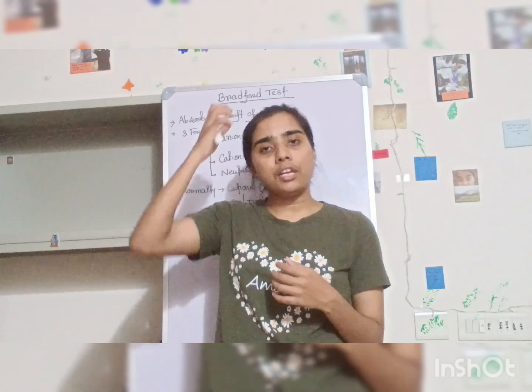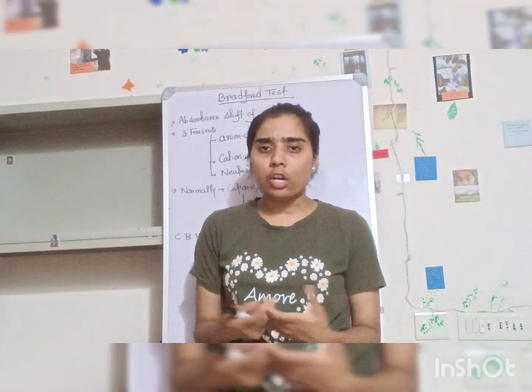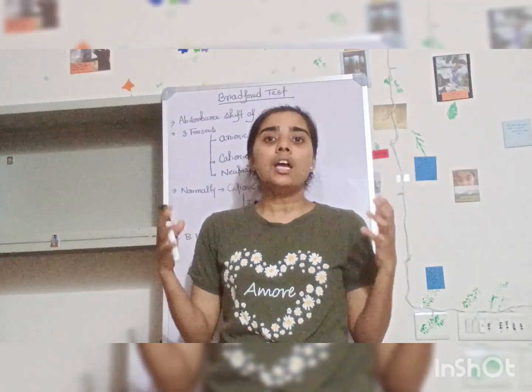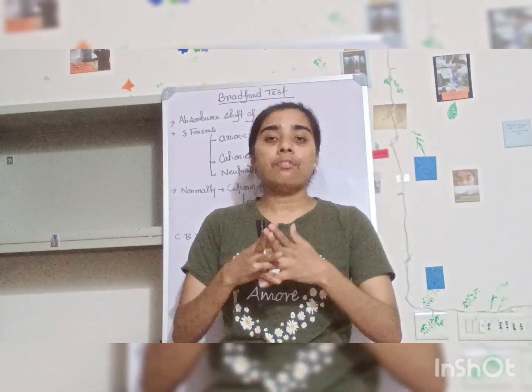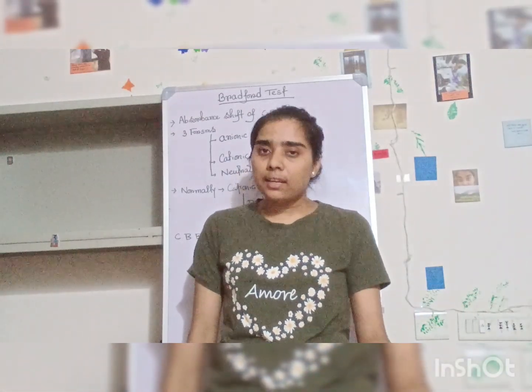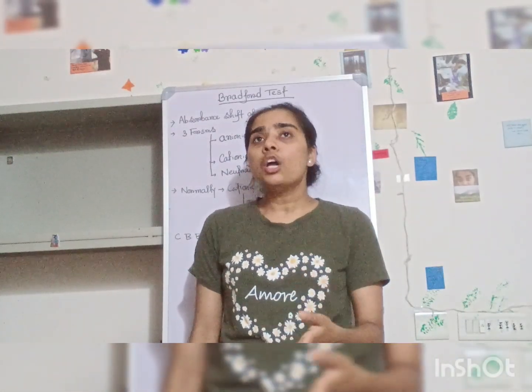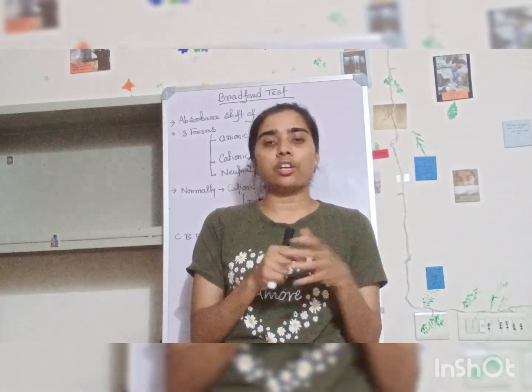But if your buffer contains NaCl, KCl, this kind of normal salt which stabilizes your protein in the buffer condition, there is no issue with that. But if your buffer contains detergent or some other molecule, then it is a little bit difficult to properly solve the correct protein concentration.